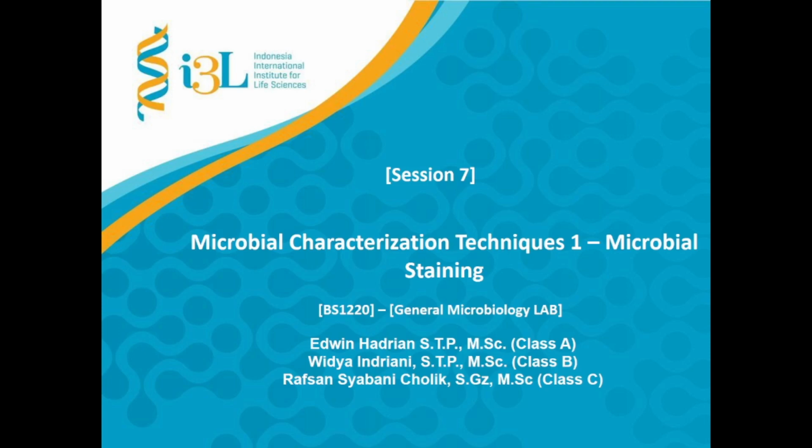In this video, we will be discussing microbial characterization techniques 1. One of the most popular techniques that has been widely used worldwide is microbial staining. In this video, you will also learn about the procedure, how to identify the properties and characteristics of bacteria using gram staining.